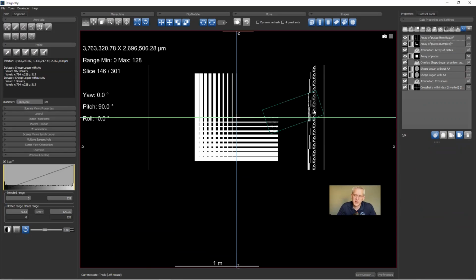For us right now, it's going to be the same as if I just did an extract structured grid. But if you have an SEM micrograph of a small area like this and a light micrograph of a large area like this, and they have a slight rotational offset, if you want to be able to do direct pixel by pixel comparisons, you could resample your low-res image into your high-res image, or vice versa.